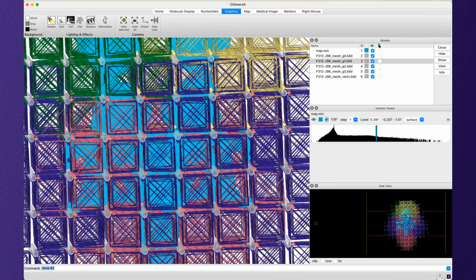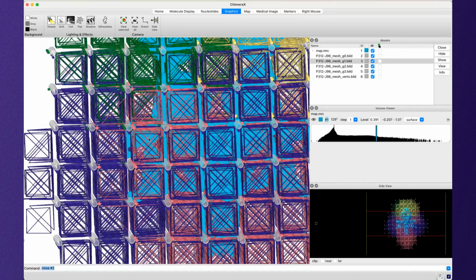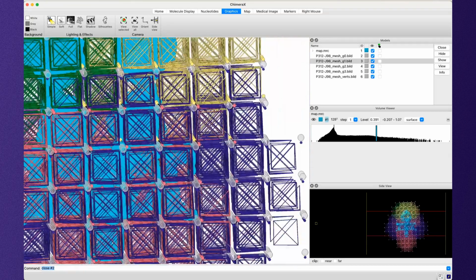And what that might do for you is it might let the transmembrane domain over here move up and down relative to the part over here, even though the micelle is still rigid over here, because the micelle and the transmembrane domain are not fused. The micelle would only be fused to the fabs.